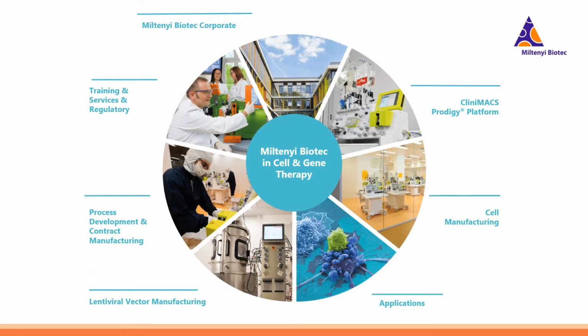Hello everyone, I'm Nilufar and today I'm going to talk about our clinical grade Treg manufacturing with a focus on GMP compliant cell sorting and also our MACS GMP platform.